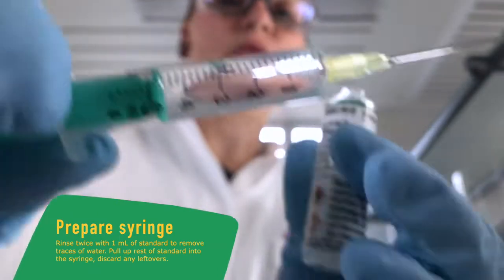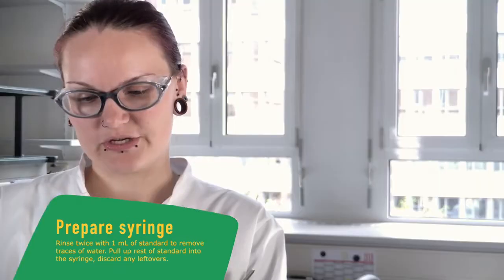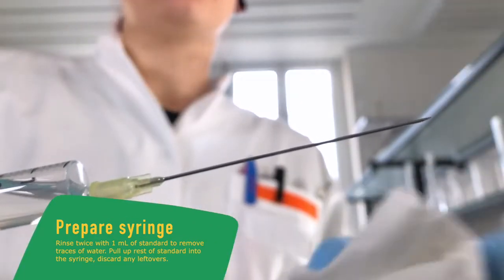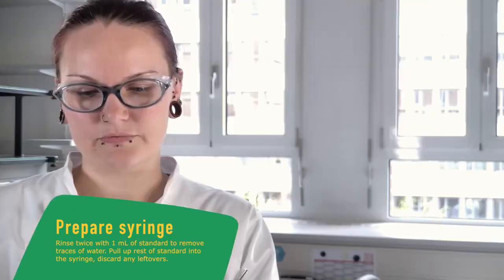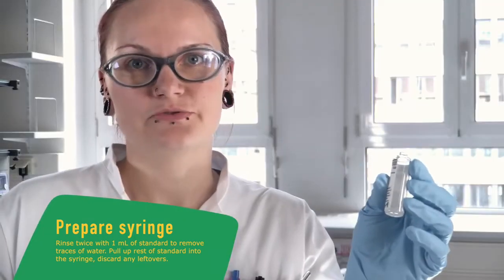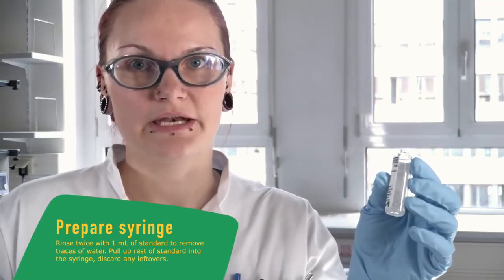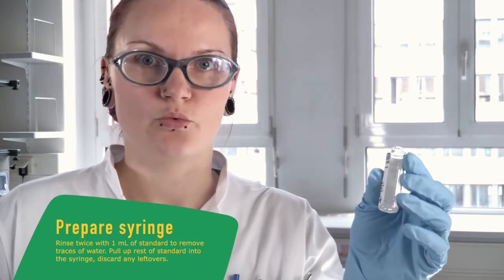And in the end, we also pull up a little bit of air to make sure that there is no liquid in the needle. Afterwards, we wipe the needle to make sure that there is no liquid on the outside. You cannot use the leftover in an ampoule again because the water content will change, and that's why we throw it away.